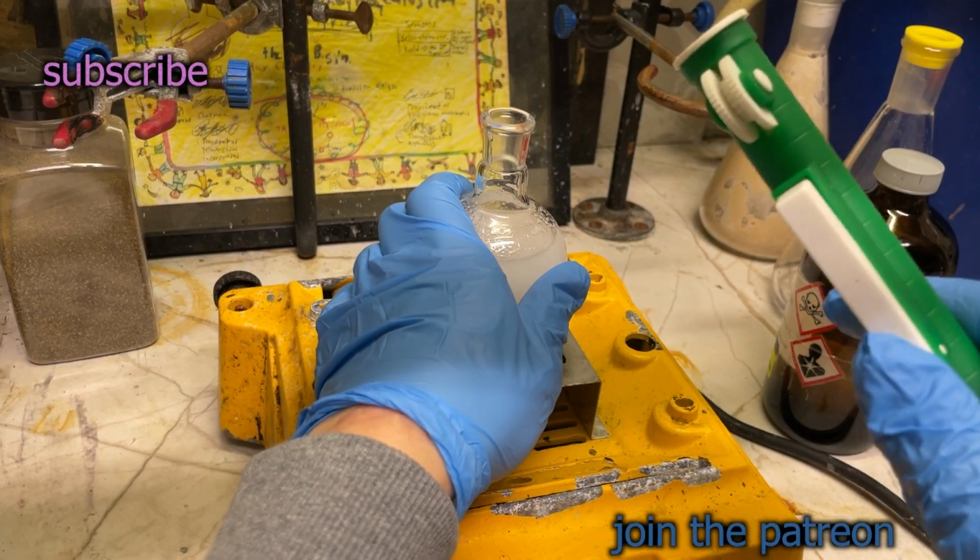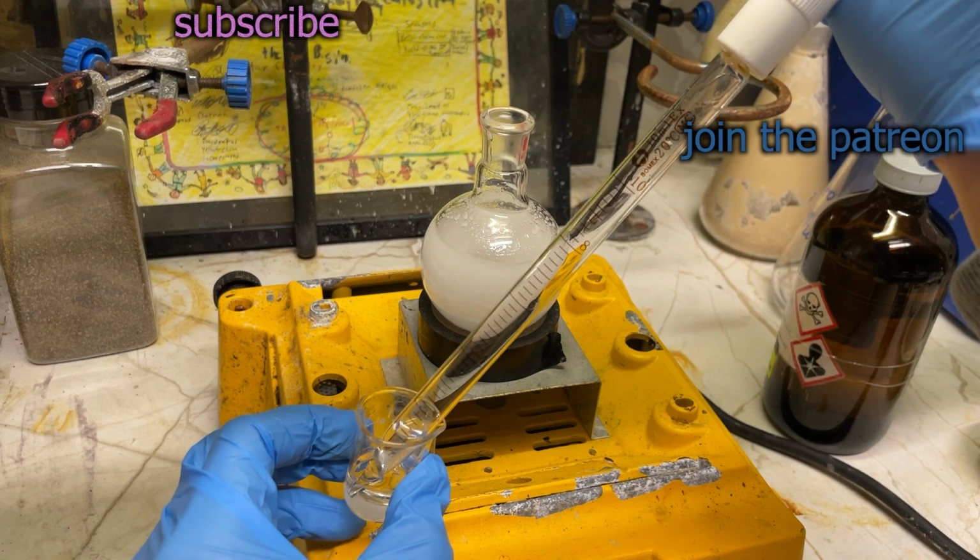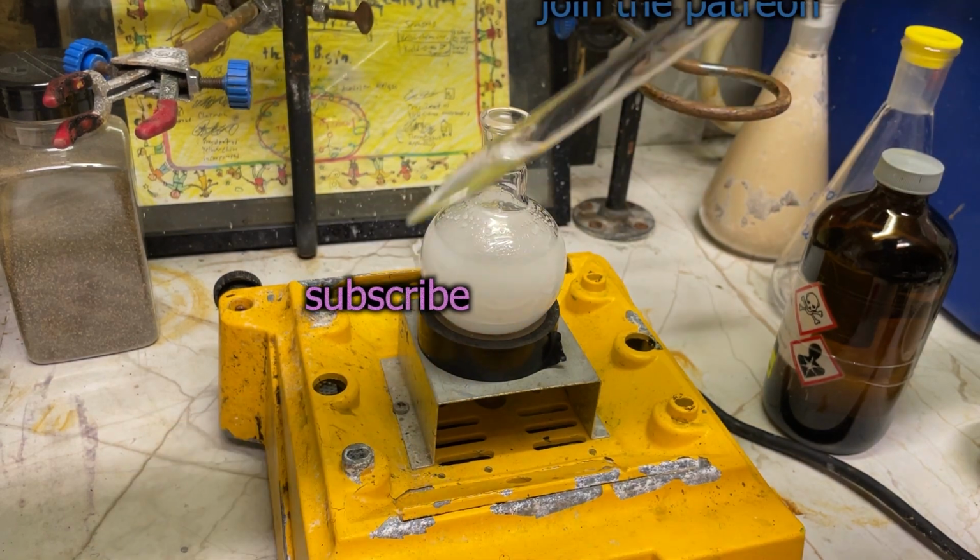Now, I did actually try using this for reductive amination, but my amination failed twice. I don't know what I'm doing wrong, honestly. Maybe I'm just bad at chemistry.